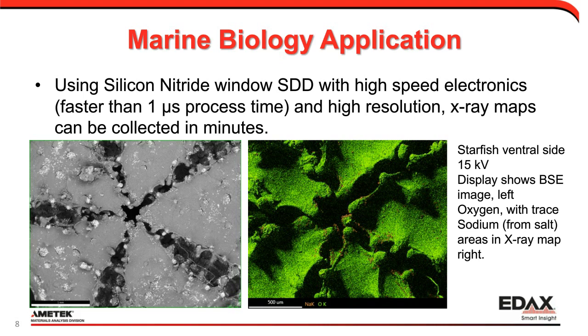But when we look at the EDS map, the EDS detector comes into the chamber at an angle entry, whereas the backscatter detector is flat above the sample, so it gives that flat appearance. But the EDS detector is subject to topography because it has that angular view. So anything that's shadowed or pointed away from the detector is going to appear shadowed, and that's certainly what we see there.